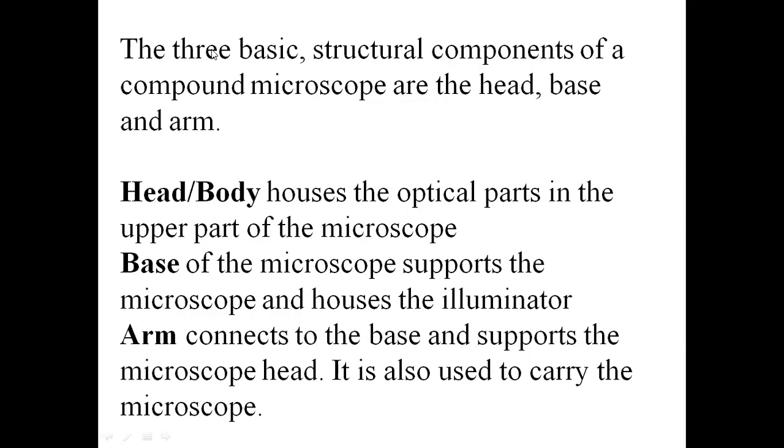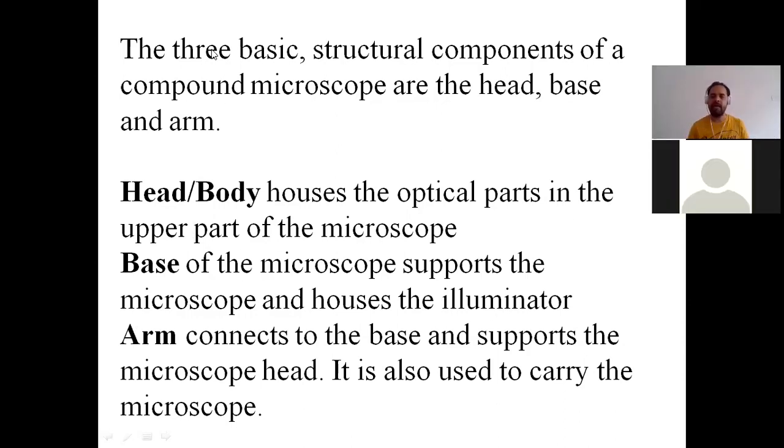Then one more thing: how do you carry the microscope whenever you are handling any microscope? The normal stereo microscopes or the compound microscopes can cost around 40,000 to 60,000. So it is a very costly instrument, right?